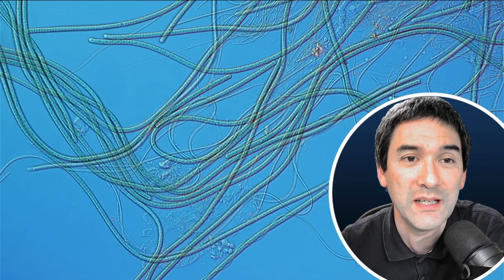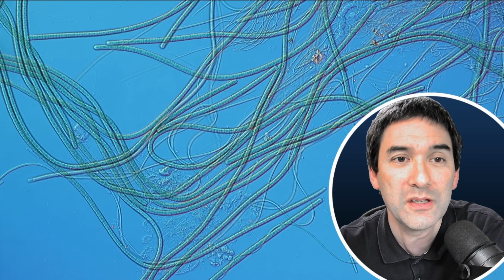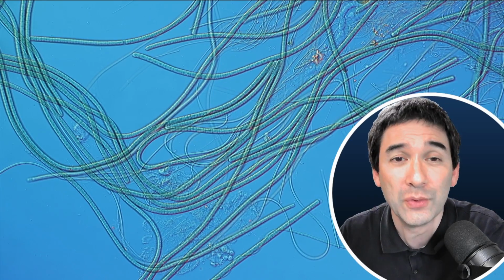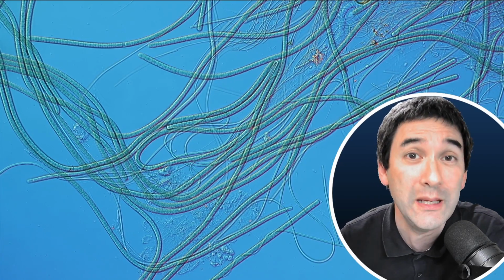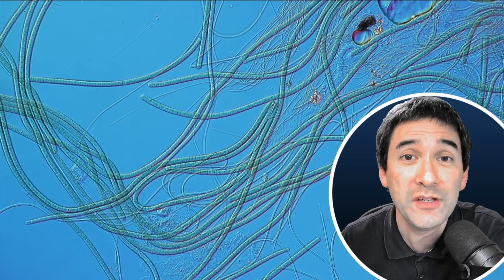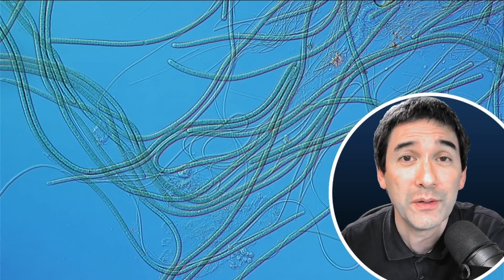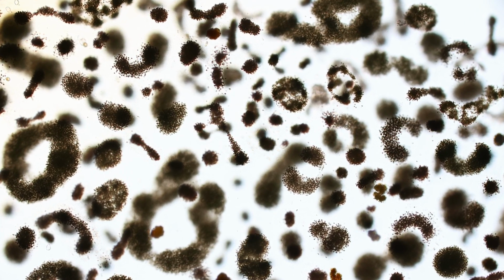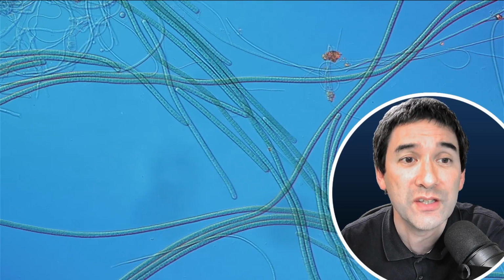Yeah, you can see that this particular specimen is showing this slow gliding motion. Those cyanobacteria also come in a variety of different shapes and forms. These here are, of course, in filaments, as we can see. However, there are also others that have vastly different shapes, are circular, round in shape, and so on. So essentially, the diversity is quite high.